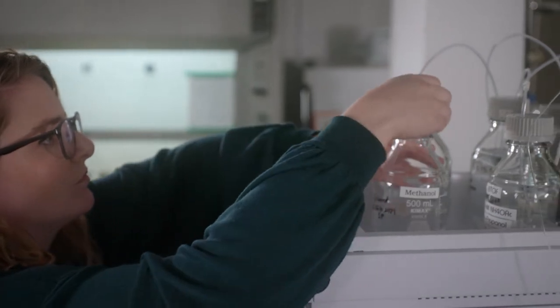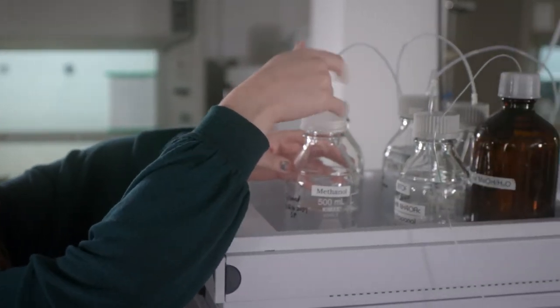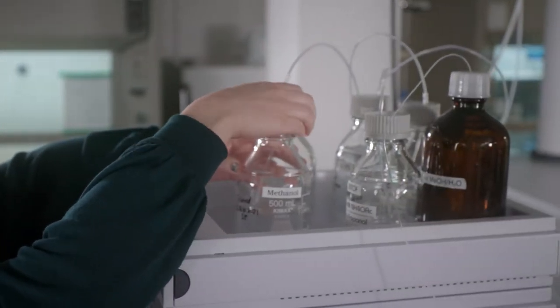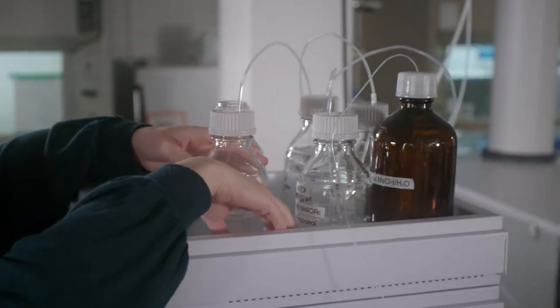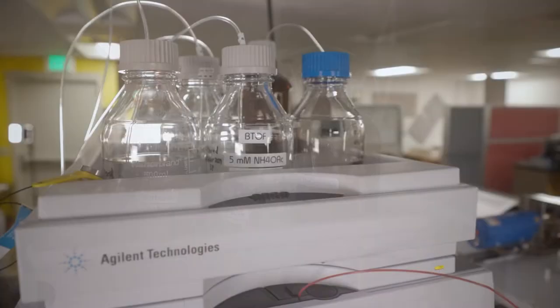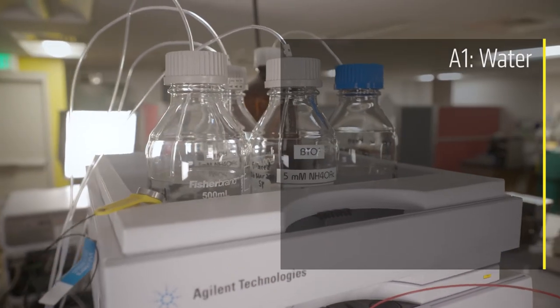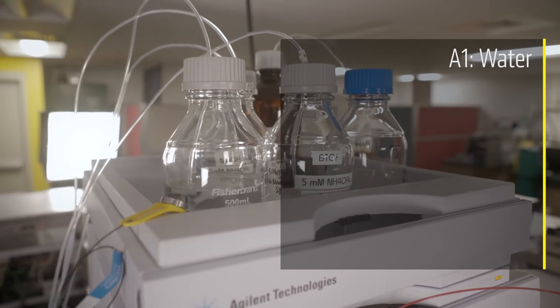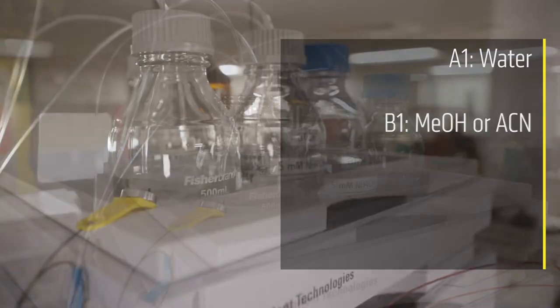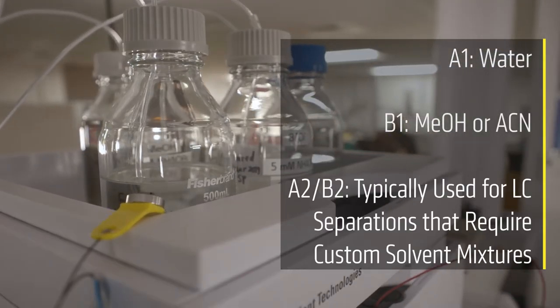For flow injections that bypass the LC column, you will only need one solvent, so pick whichever is most compatible with your sample. On channel A1, we typically have water and on B1, we typically have acetonitrile or methanol.